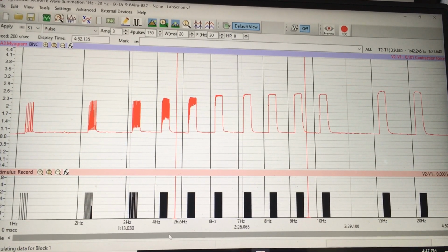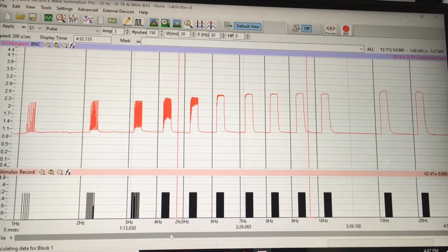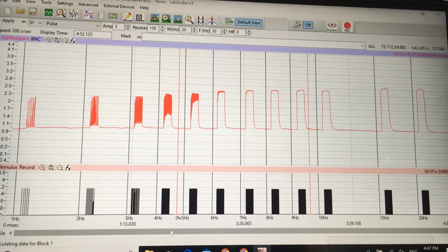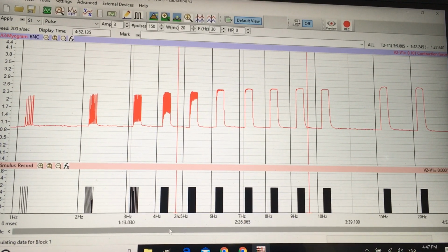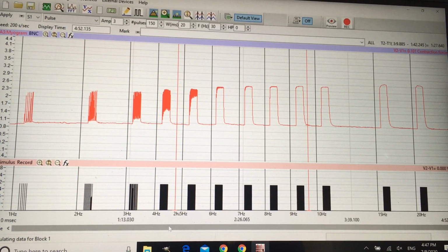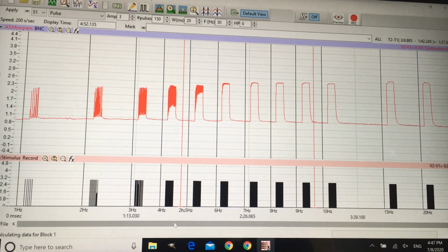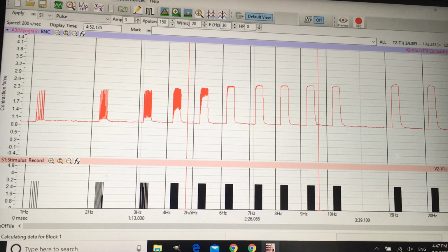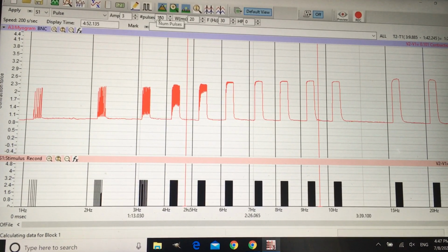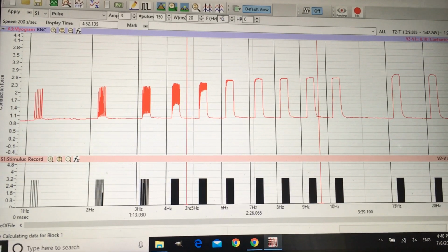Alright, this is the explanation of experiment E, muscle twitch summation and tetanus. On page 80 of the lab manual, you have a table. In this experiment, we type the number of pulses and frequency into the program to stimulate the muscle with different pulses and different frequencies. If I can show you here on the screen, every time we just change the number of pulses and the frequency, and we stimulate the muscle.